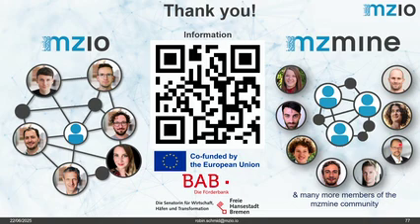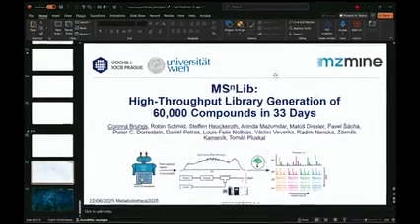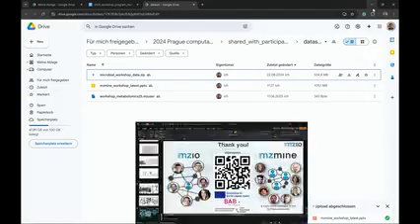Maybe just one last quick question, and you can still talk to the guys throughout the conference. Hi, thank you so much for the workshop. I wanted to find out how to process DIA data. I've tried recently, and I got an error that said I should select at least one feature list.